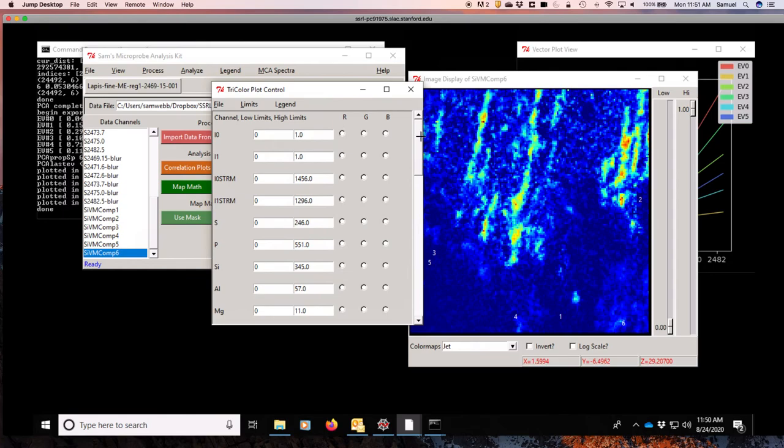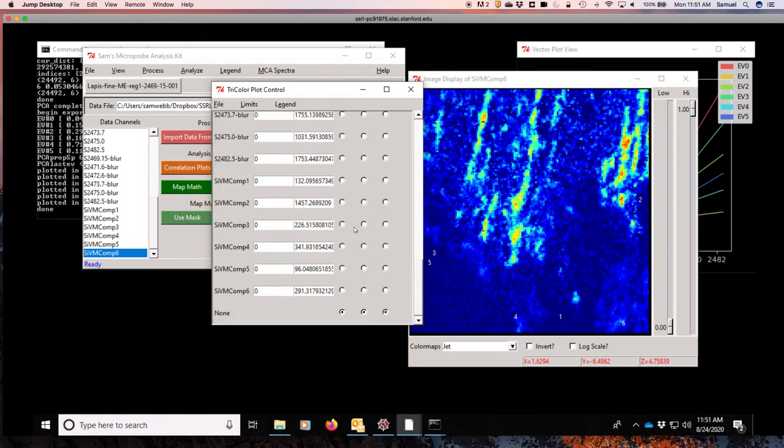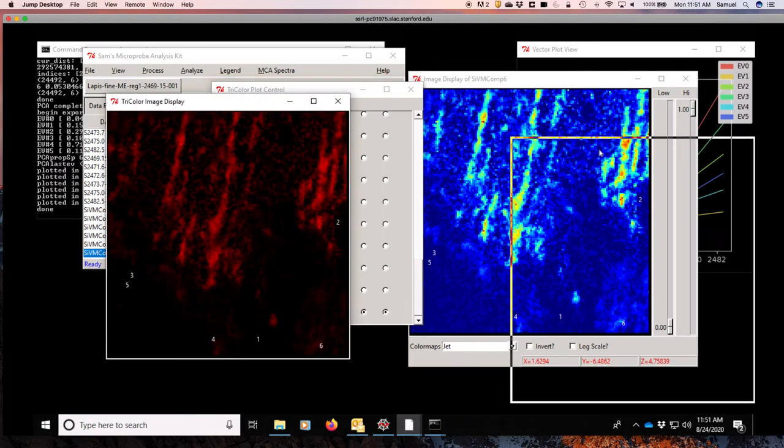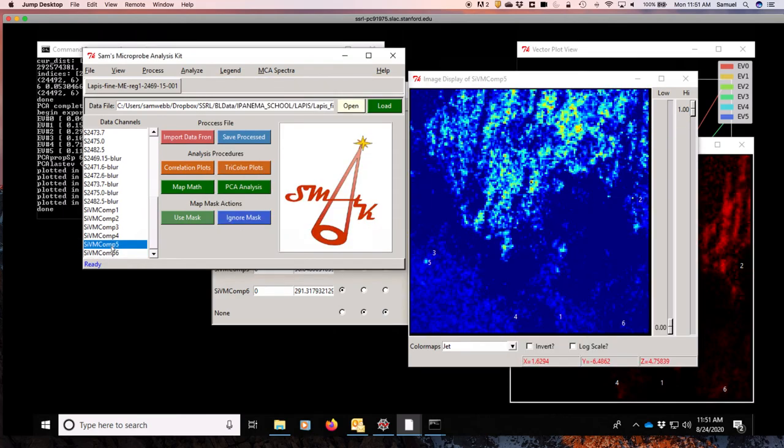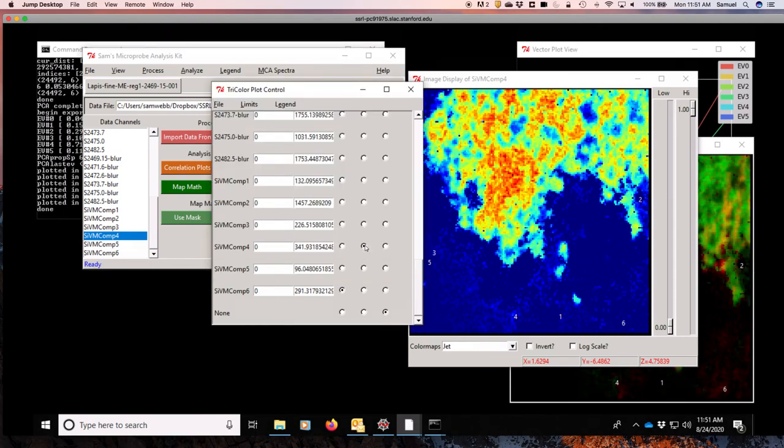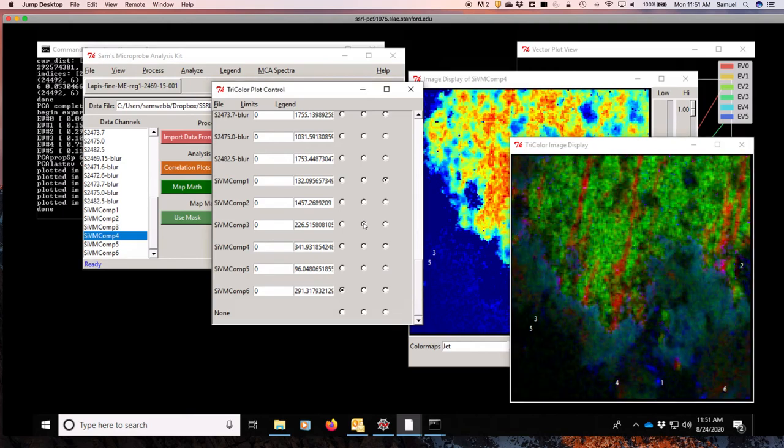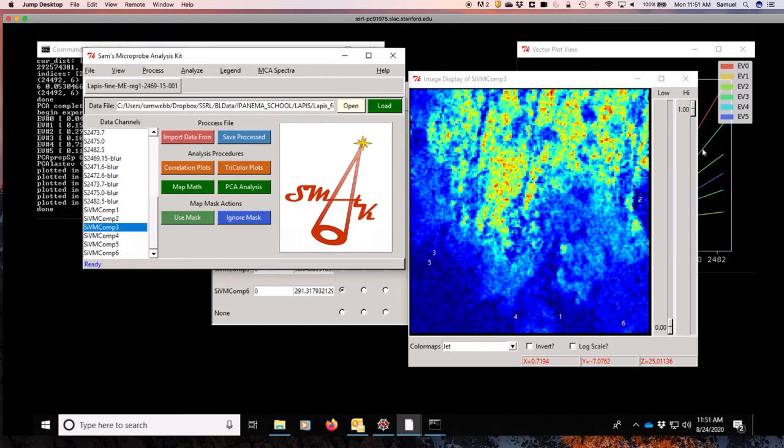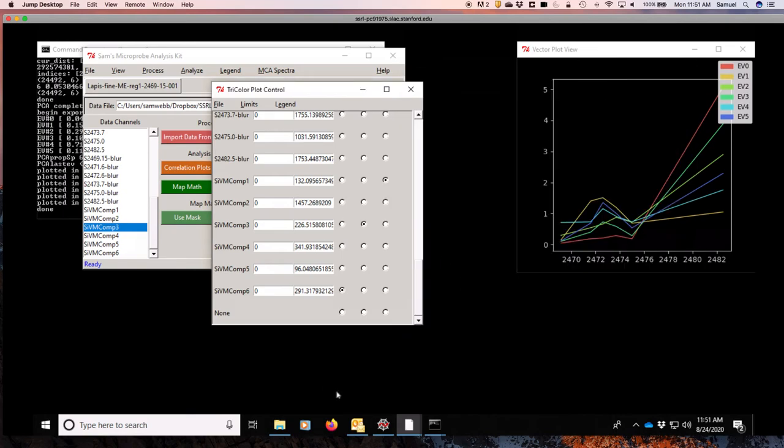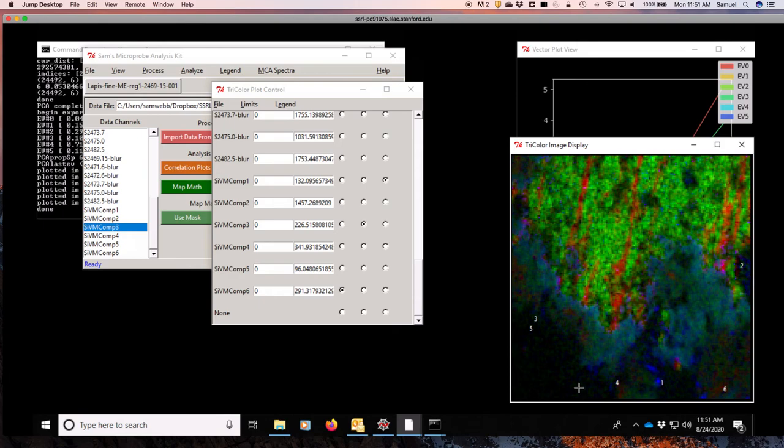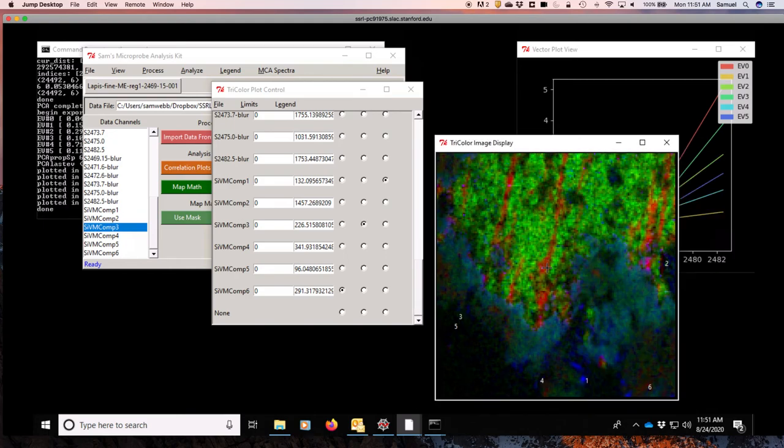We can even go to our tricolor plots here, for instance, and see how this looks together. I'm going to make component 6, which is this streaky one, into red. I think we want to try 4 being green. And we had our background. Let's actually make that component 3. And so, here, now we can see that background and these two different portions of streaky lapis all in the same plot here. This gives a really interesting dynamic.